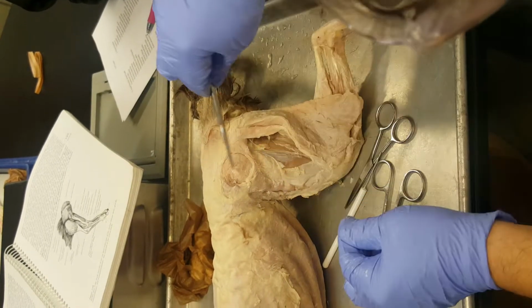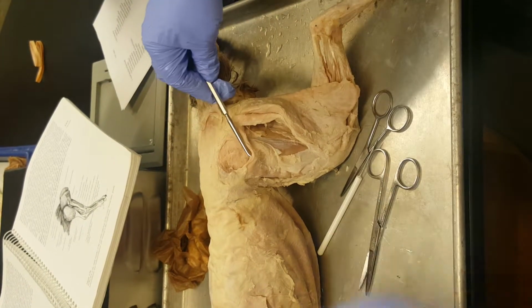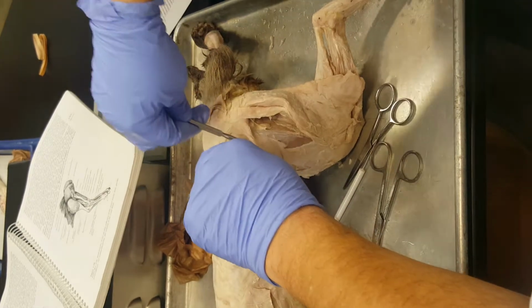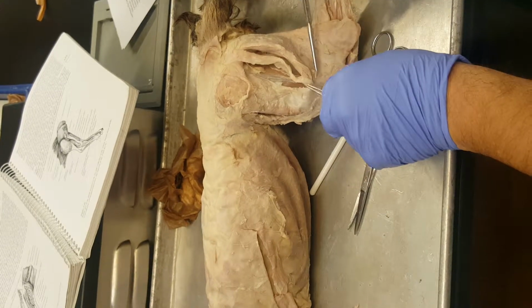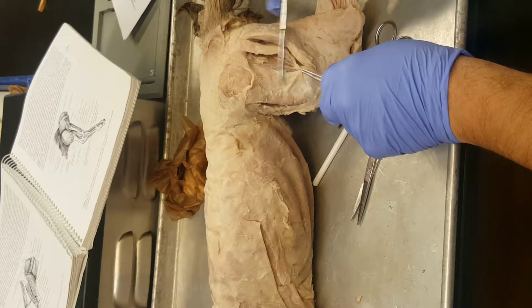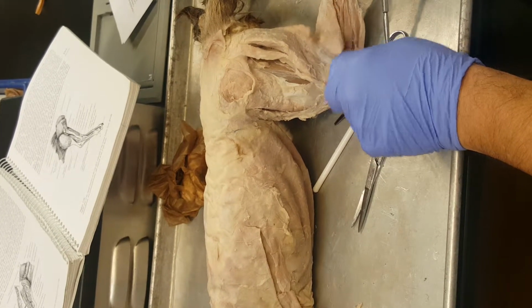And then this muscle here is the tensor fascia lata, which I can't get in. Let's see what the deal here is. Okay. That's the tensor fascia lata, and this is the aponeurosis of it, so leave this connective tissue intact. Don't cut this connective tissue. That's all part of tensor fascia lata. Goes down the lateral thigh.